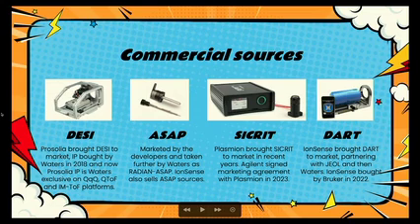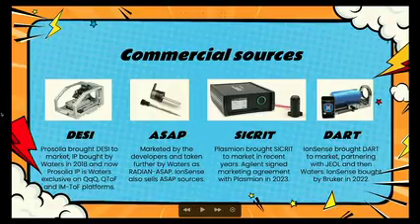And then there was the DART QDA or QDA DART system. Again, a single quadrupole system, and Bruker bought out IonSense in 2022, and there's some developments that I'll talk about when I go through the vendor-specific section, where Bruker have now integrated the DART source onto a triple quadrupole instrument really quite nicely.